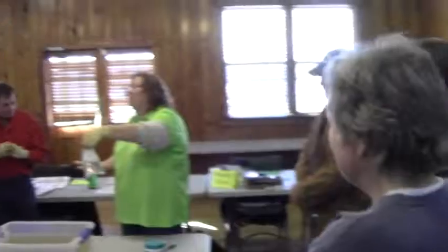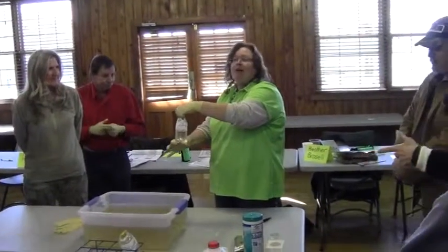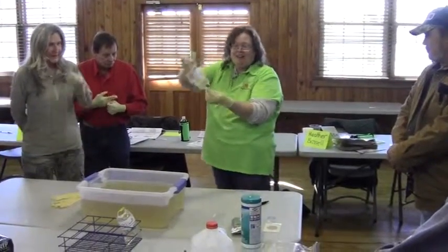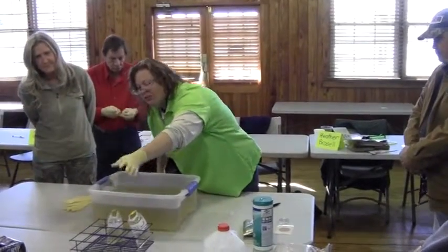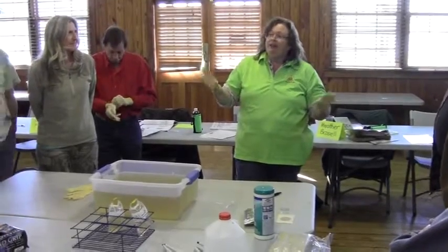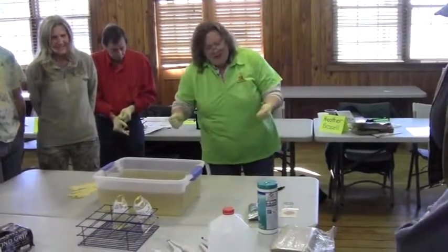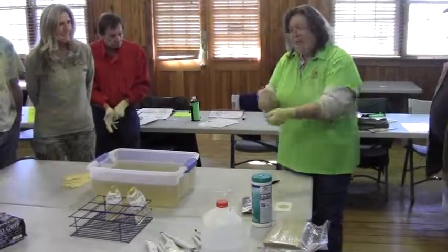Alright, so now that I've got my sample, what do I want to do with it? Put it in the cooler. I want to make sure that it's not going to leak. I've put it into my cooler now. We are ready to go home and plate our samples. Now, we are going to pretend that my gloves are dry, because we have taken these off.